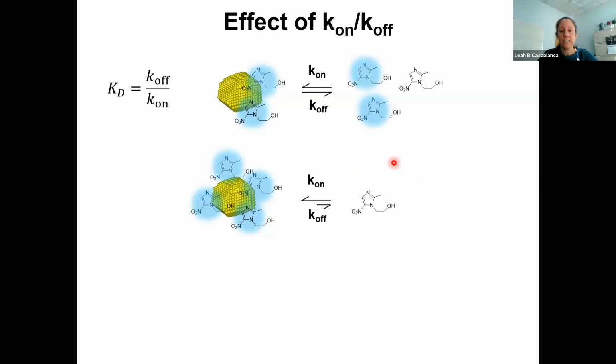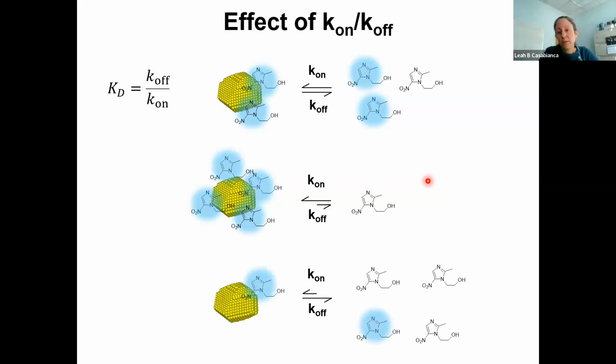So what we're observing in the STD effect is free ligands that have dissociated from the receptor surface and retain that saturation. So if the binding is too strong, we don't observe any STD effect. On the other hand, if the binding is too weak, then not enough ligands will bind to the receptor and be able to receive that saturation.